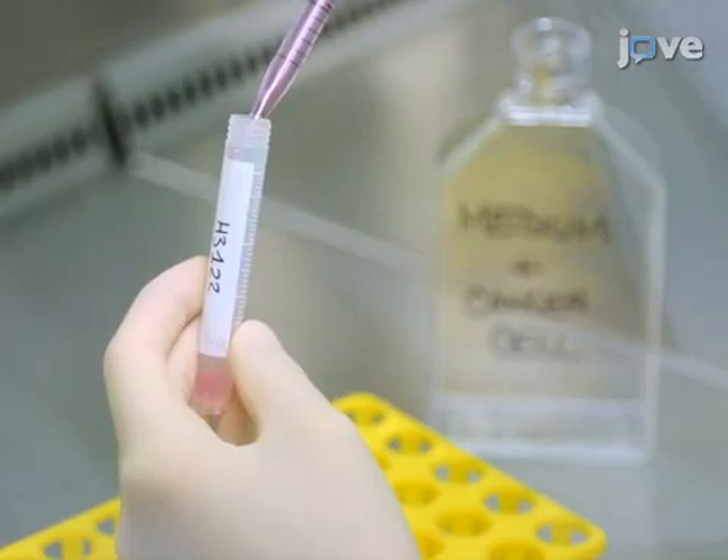Next, remove the wire from its glass packaging. Dip the functionalized gold part of the wire into the vial.